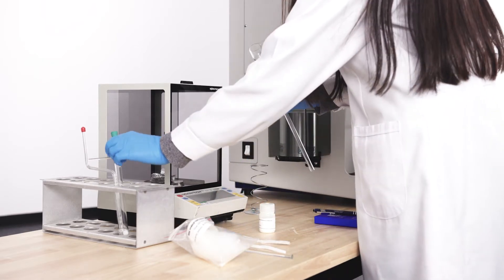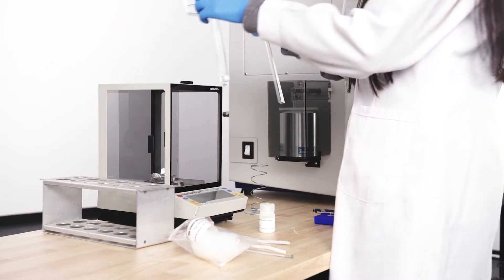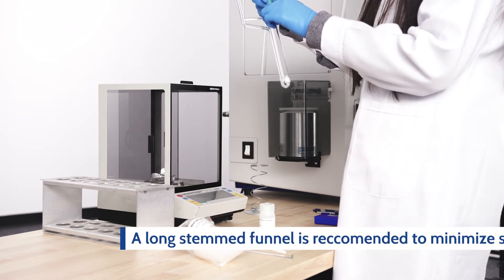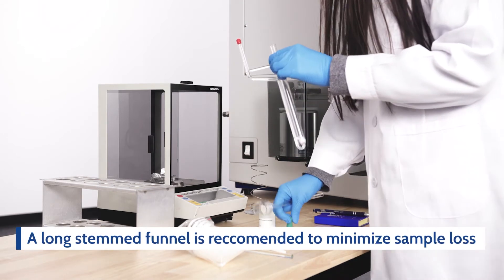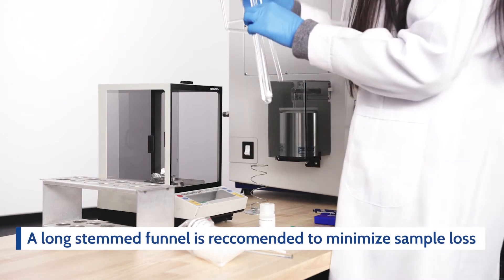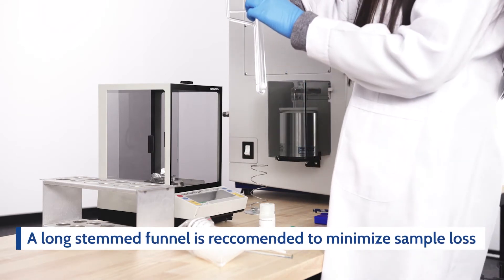Transfer the sample into the tube using a funnel. We recommend using a long stem funnel to minimize sample loss.